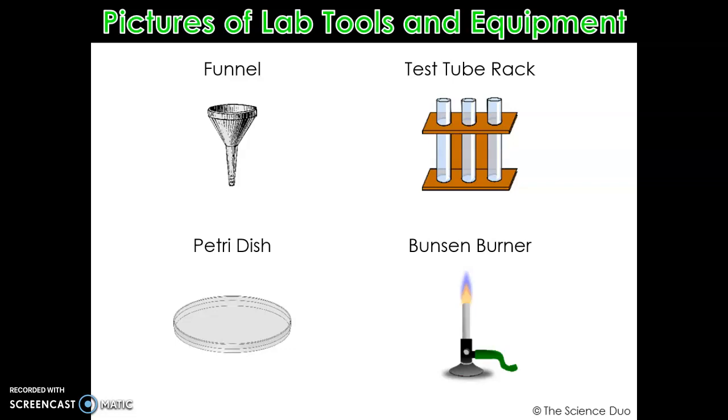The Bunsen burner, for you guys in physical science and chemistry, you're going to see a lot of in videos, because chemistry involves a lot of heating chemicals and substances, and Bunsen burners are just there to act as the heat source, essentially.